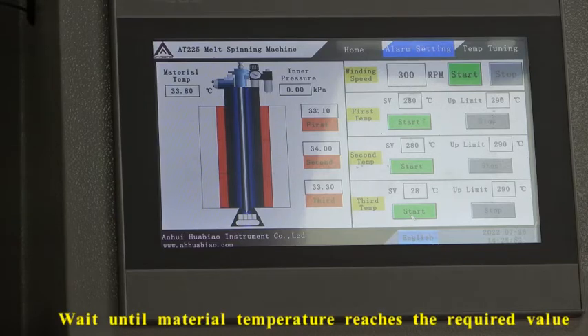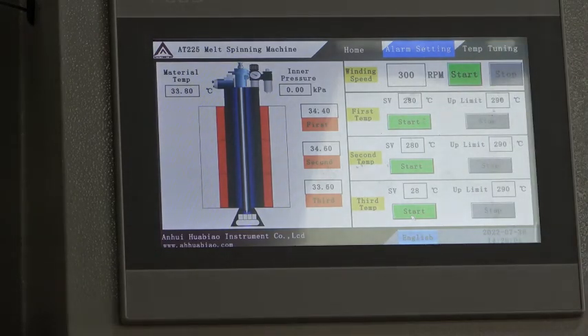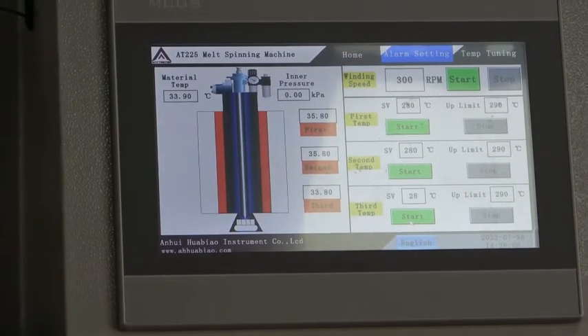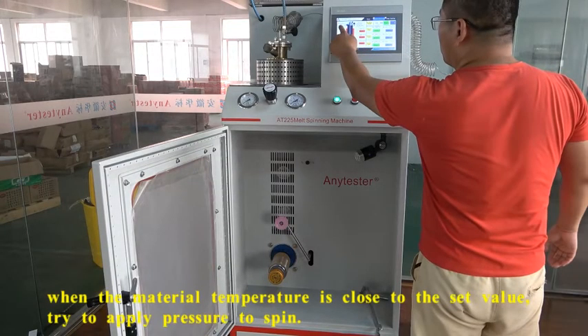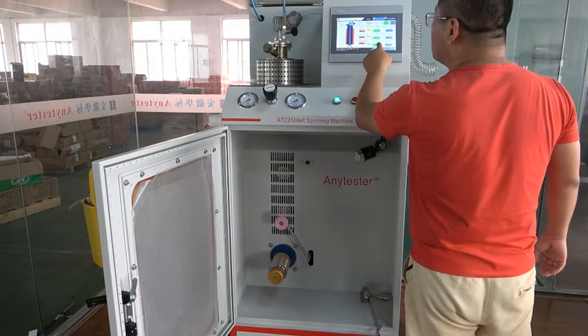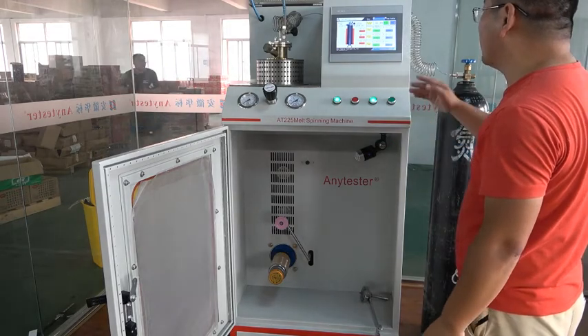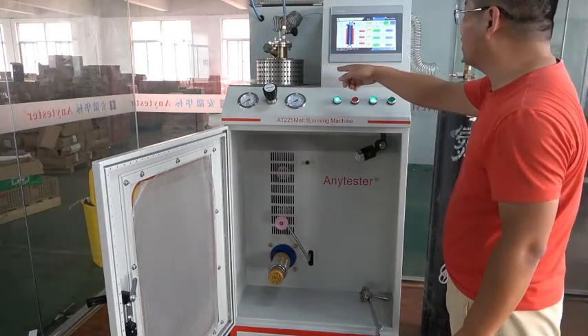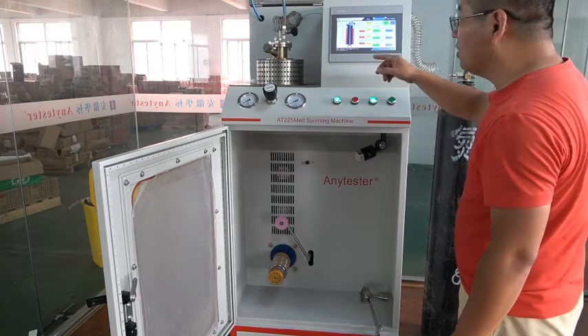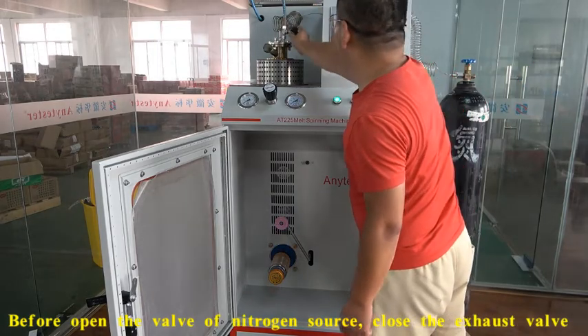Wait until the material temperature reaches the set value. When the material temperature in the barrel is close to the set value, you can try to apply some pressure into the barrel to check if any material can come out or not. Before applying pressure, close this valve.